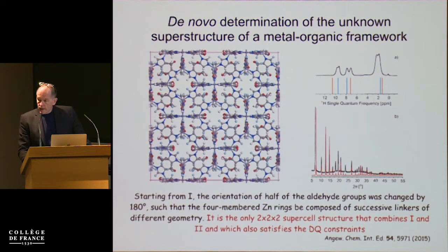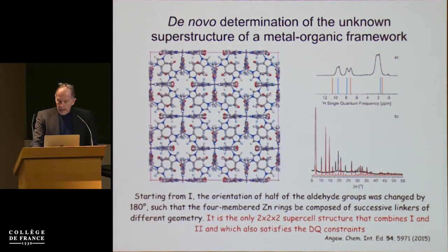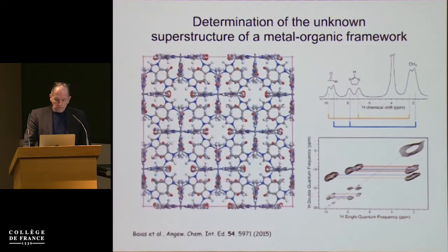It's not perfect agreement because obviously this structure can have defects. Those defects, as long as they occur only maybe once every 20 unit cells, won't make any difference to the NMR. Okay, but they will mean that the PXRD says, no, it's not quite that. And so the PXRD, which is a kind of black and white technique, will say, no, it's not quite that symmetry. So it's interesting to see here that NMR can solve the structure where PXRD will never be very happy.